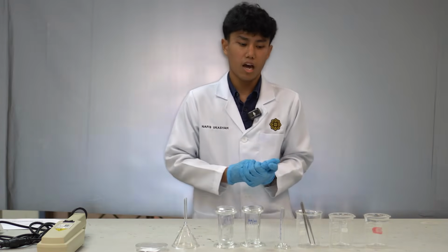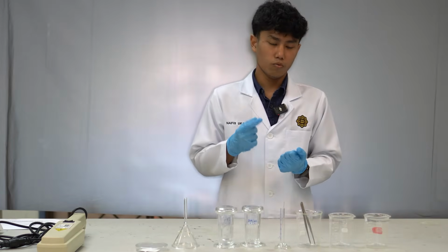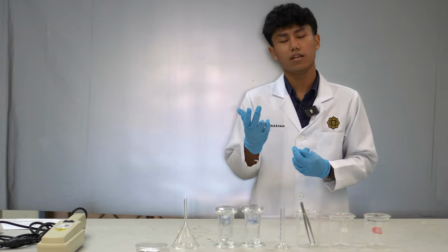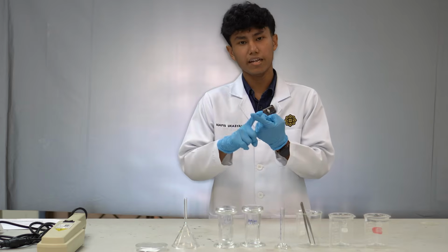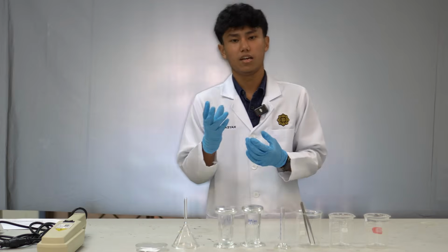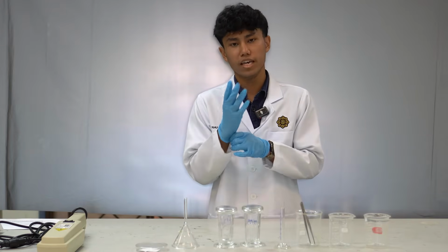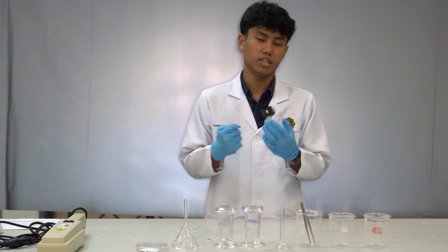After that, while we are drawing on the TLC plate, we must use a pencil instead of a pen. Why? Because a pencil is made from graphite, so graphite is insoluble in the solvent, so the baseline and the mixture will stay fixed. Pens have chemicals. A ballpoint pen has additives which function to preserve the ink, so it will affect your sample and interfere with UV detection.